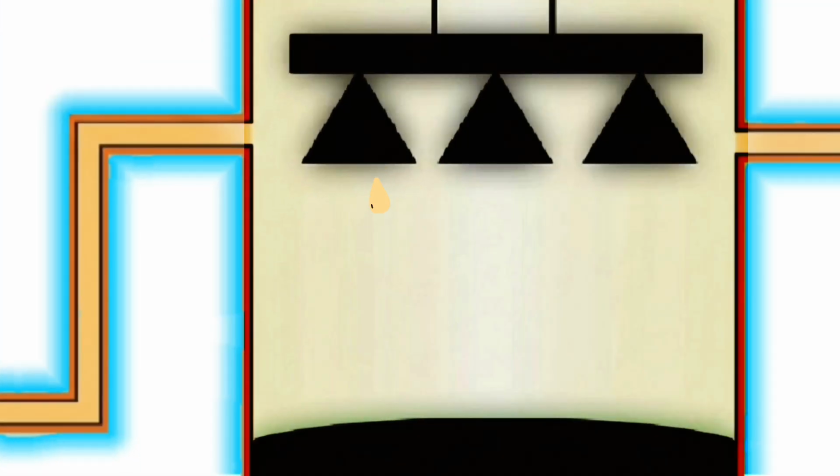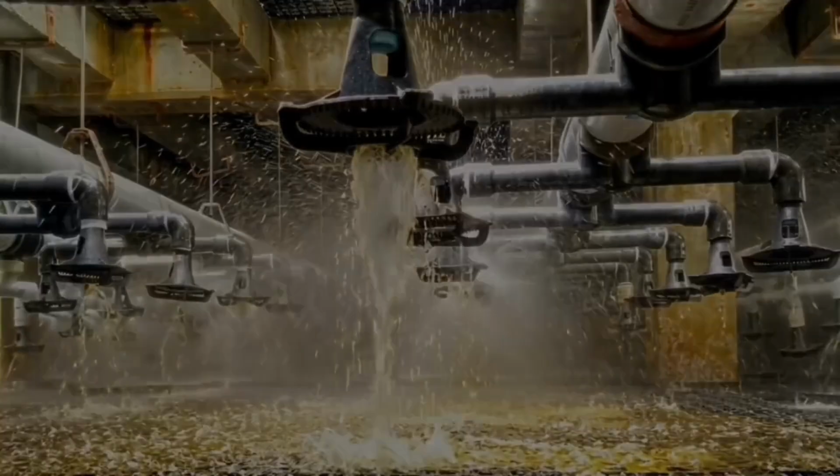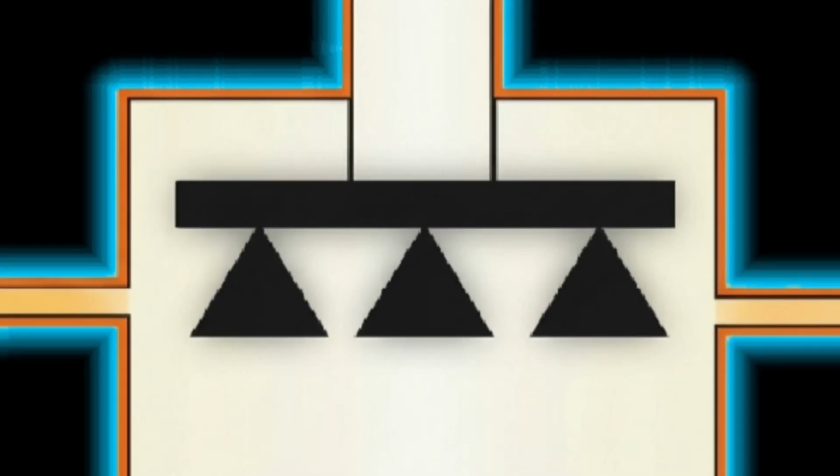This is then absorbed by concentrated sulfuric acid to give us a thick, gloopy oleum. This can be thought of as over 100% sulfuric acid, although it is sulfur trioxide dissolved in sulfuric acid, and it does things that sulfuric acid can't.